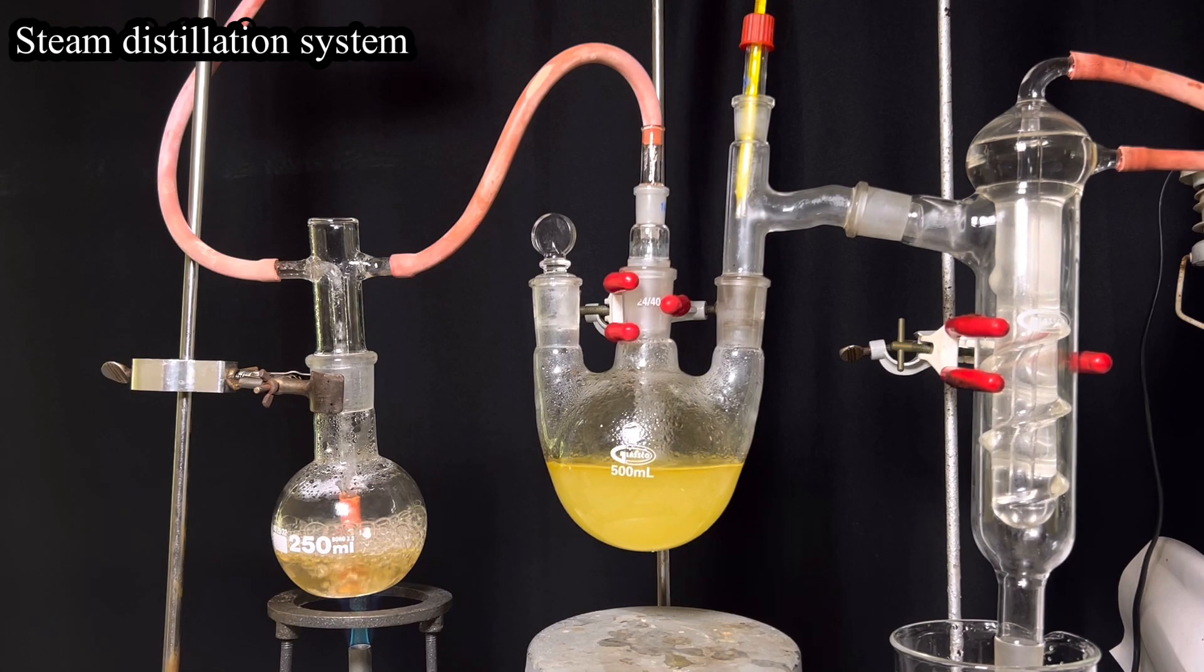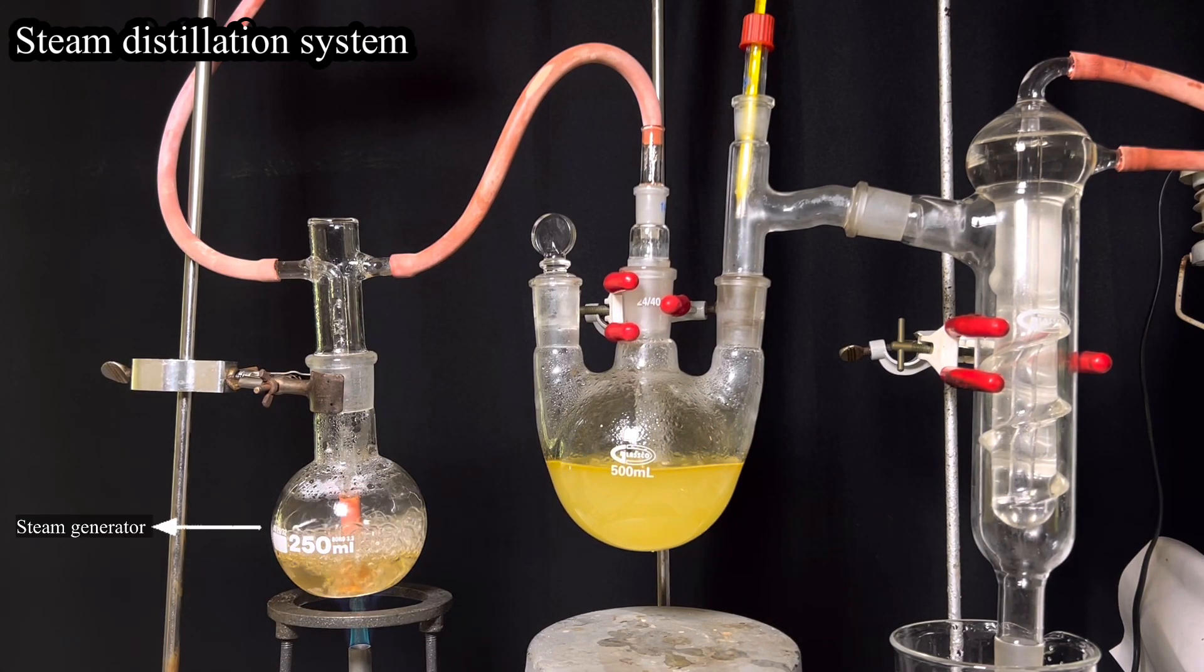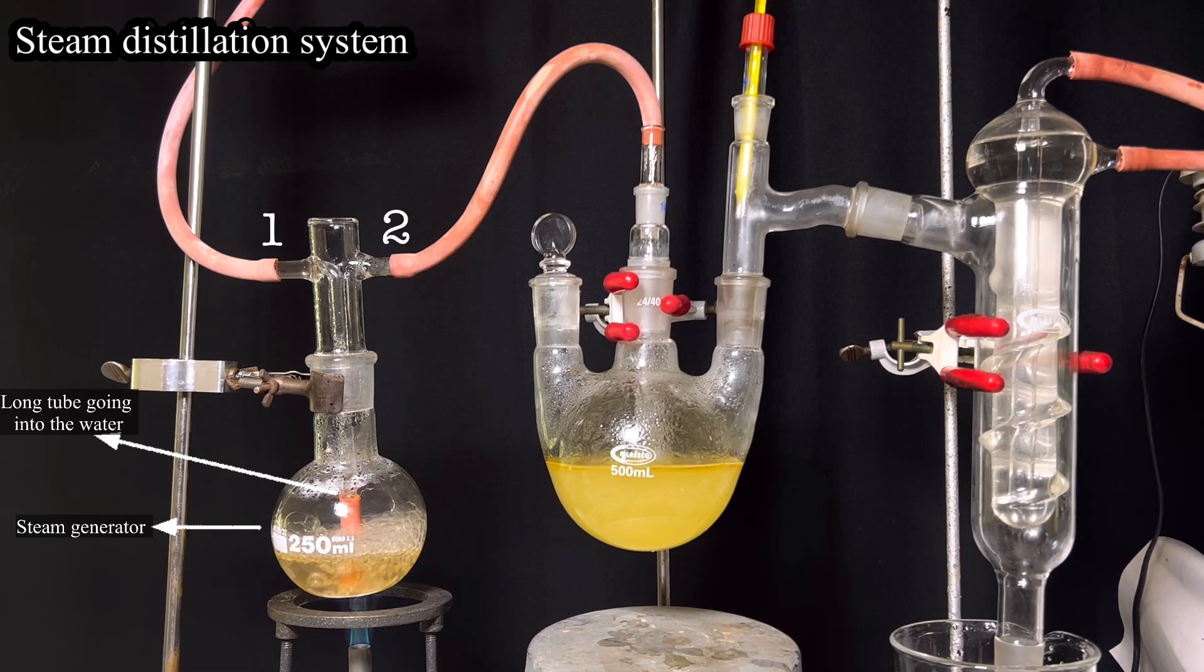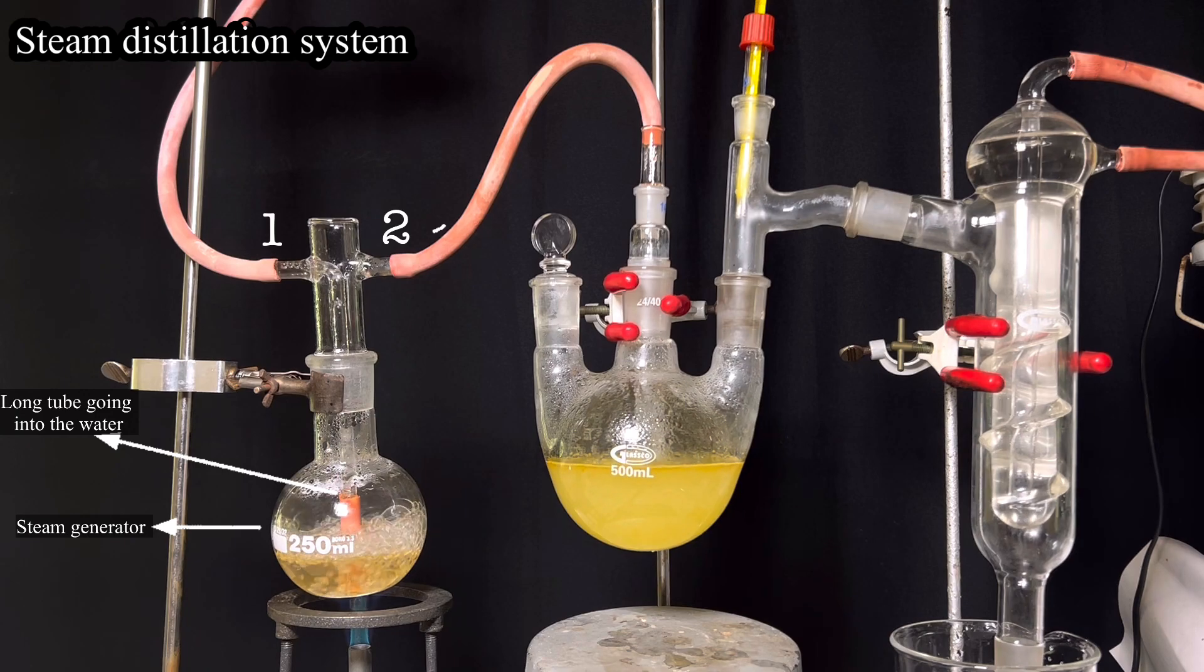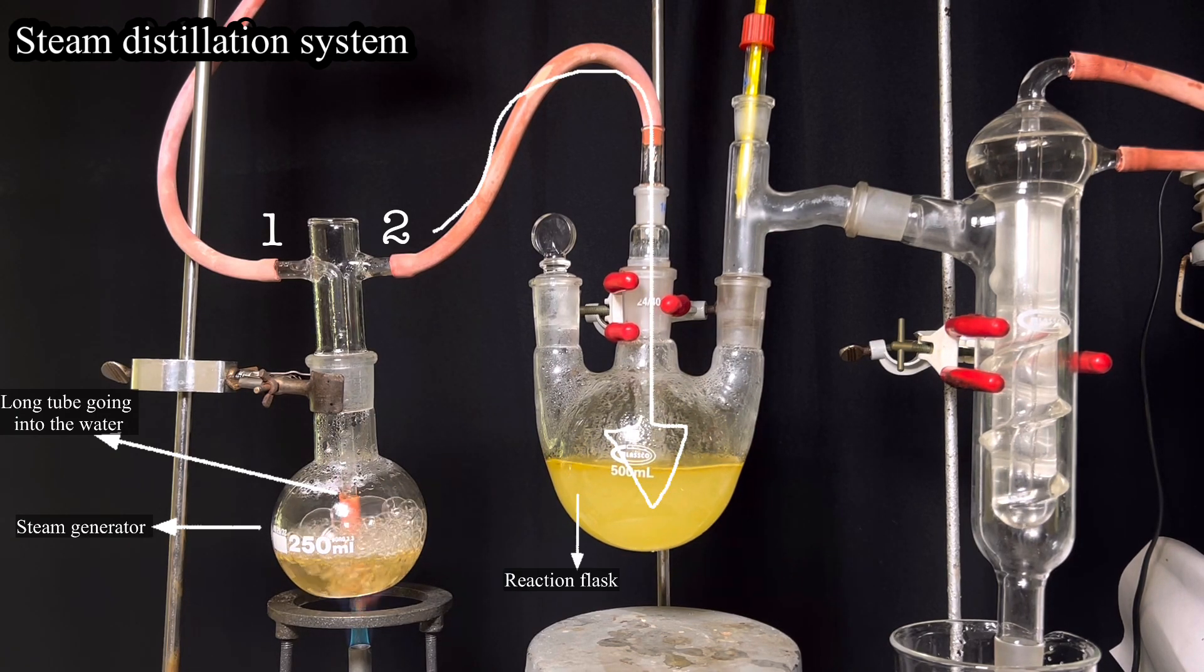Now, we will have the steam distillation system functioning. The flask on the left side is the steam generator flask. It has two openings. One of the opening is a long tube that goes into the water present in the flask. The second opening has a tubing attached to it and this carries the steam to the flask in the center which is the reaction flask.